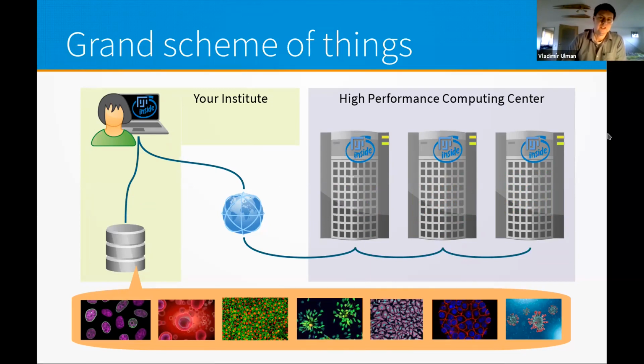So first of all, we have to connect to that. Then we have to upload the data. That is an explicit step.